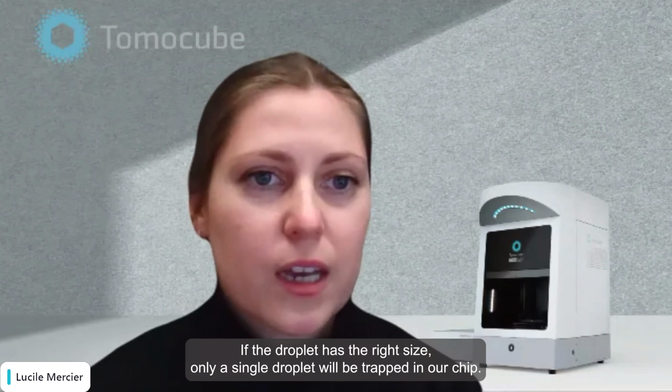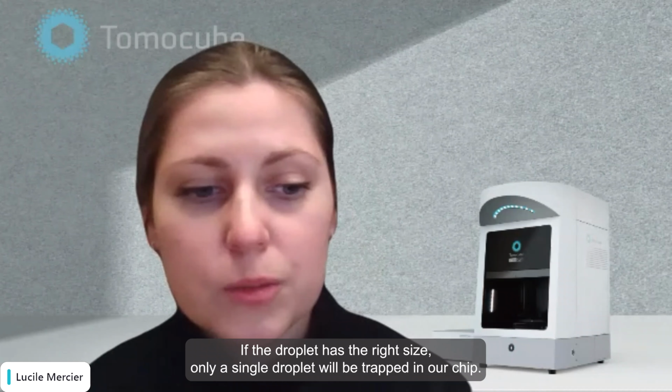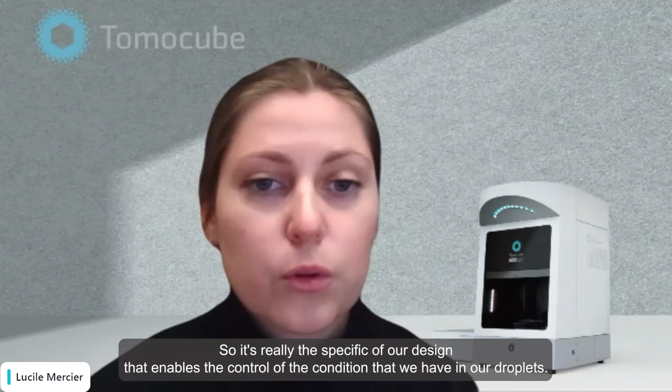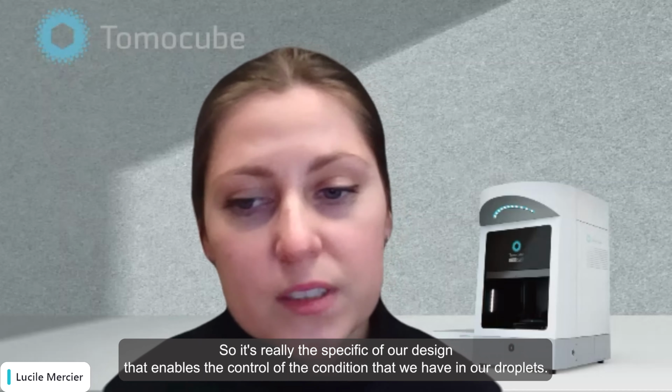If the droplet has the right size, only a single droplet will be trapped in our chip. So it's really the specificity of our design, and that really enables the control of the conditions that we have in our droplets.